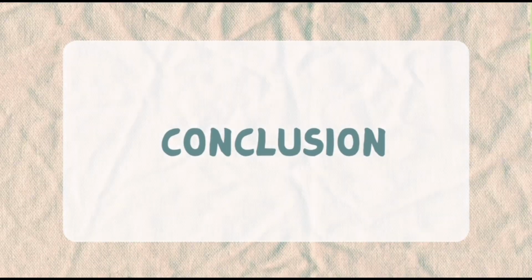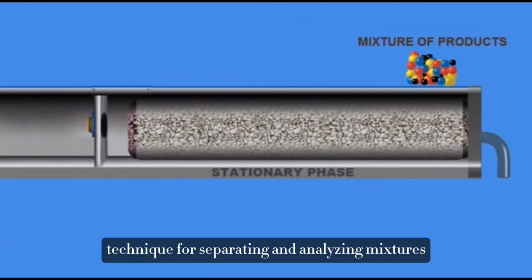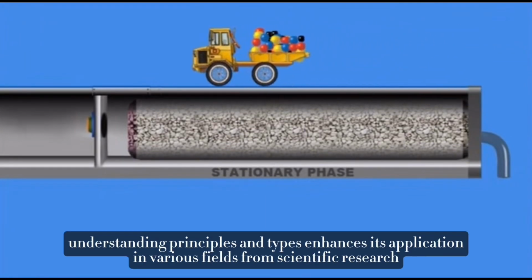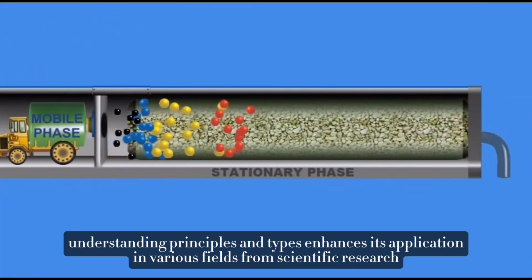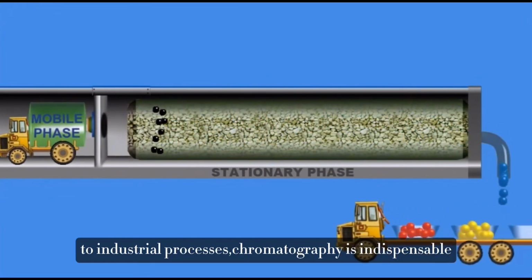Last but not least, conclusions. Chromatography is an essential technique for separating and analyzing mixtures. Understanding principles and types enhances its application in various fields from scientific research to industrial processes. Chromatography is indispensable.